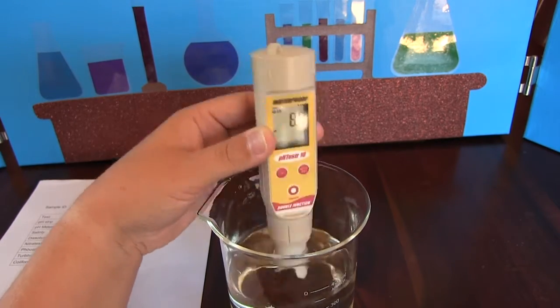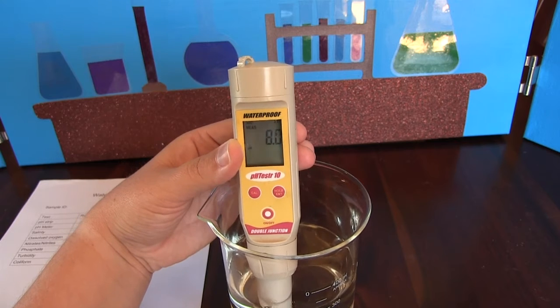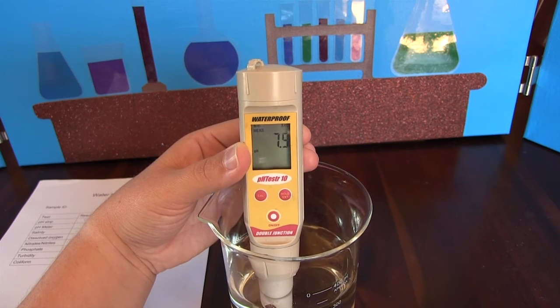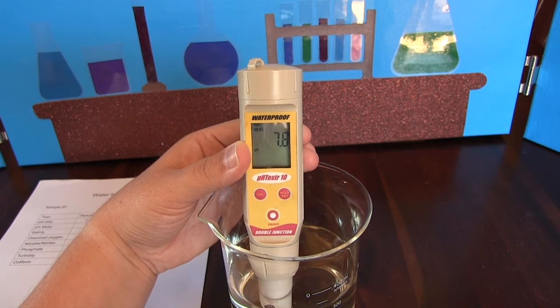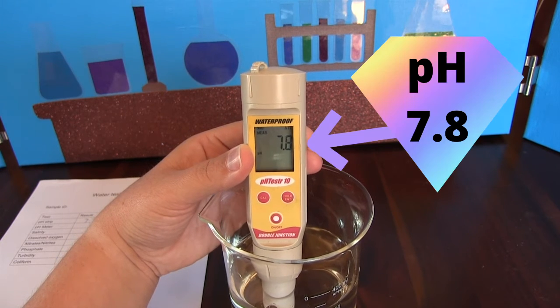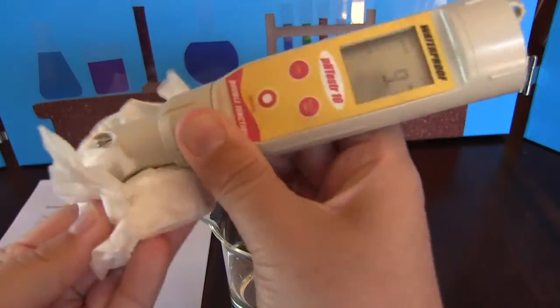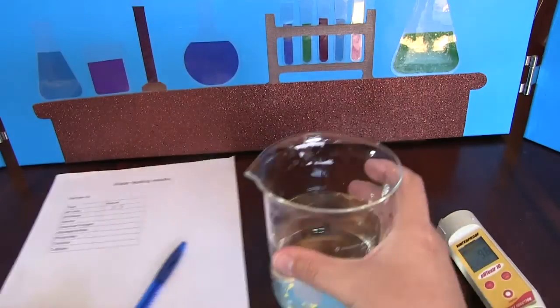You will see the pH reading start to move up or down. You might need to stir it around in the water a couple of times to get a correct result. Once the reading has stabilised, you can take note of the pH reading. Here we have a pH of 7.8. We then clean the pH meter off and record our result.